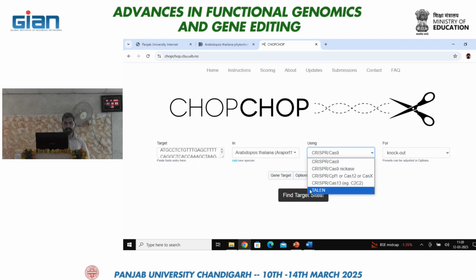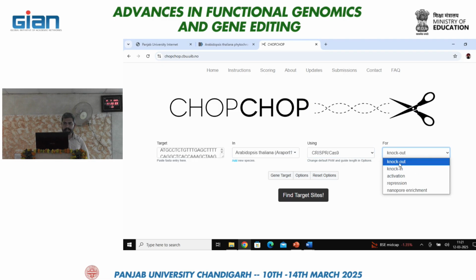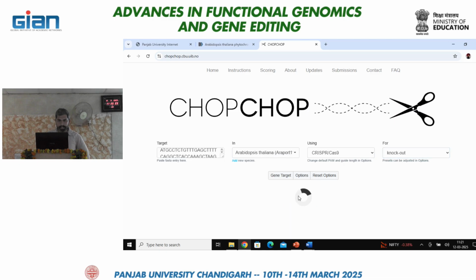Like this one even has TALEN, but we'll select CRISPR Cas9 here. You can select the purpose, like knock out or knock in. I'm not sure whether this will affect our target prediction, but we will just select knock out here. After filling all these things, you can just click find target sites.